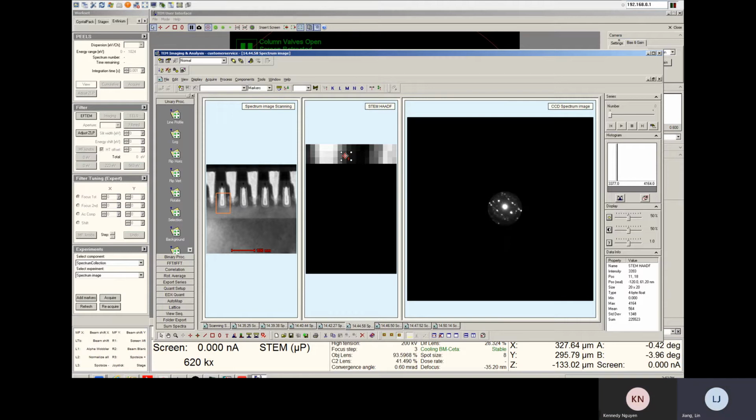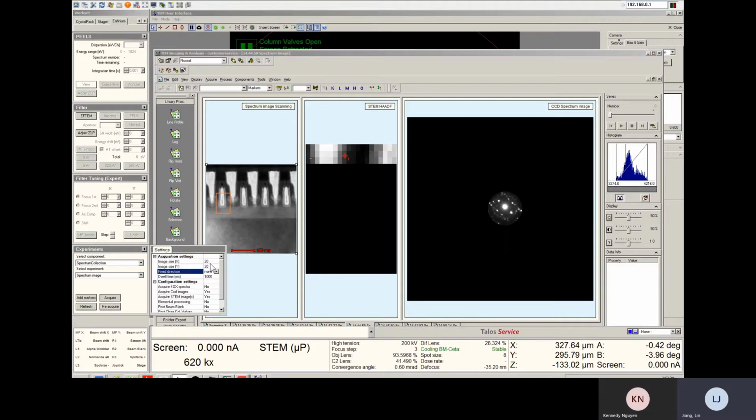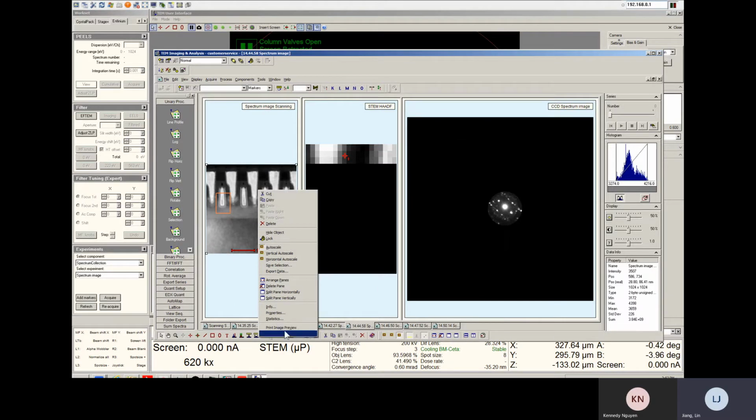So okay. I guess the solution is like this. So first, because you know this kind of free imaging is corresponding to this region, right? Corresponding to this region. So you know, this first spot is corresponding to the first spot. I think you can do kind of a calculation. First you get imaging. Also get imaging, you know the pixel size of your imaging, and then you set up corresponding here. It's like image size, X and Y. You go right click.